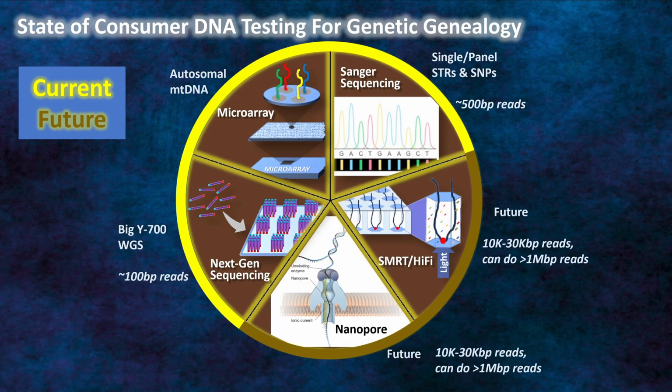Now, the upcoming ones, there are two. There's Nanopore from Oxford Nanopore Technologies, and there's SMRT, single molecule real-time. It's also been branded HiFi, and that's from a company called PacBio. And these are called long read. I'll get into what that means in a little bit, but these are future technologies.